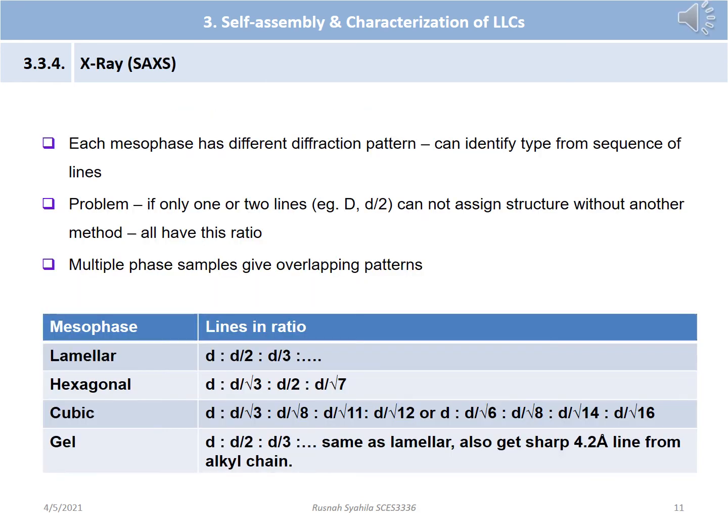X-ray analysis is the most qualitative technique for identification of the various liquid crystalline phases. It is based on diffraction studies, either light, X-ray, or neutron. Liquid crystalline structures have a repetitive arrangement of aggregates, and observation of a diffraction pattern can give evidence of long-range order and so distinguish between alternative structures. This can be used to study the extent of translational or positional order, and thus infer the type of liquid crystal phase.